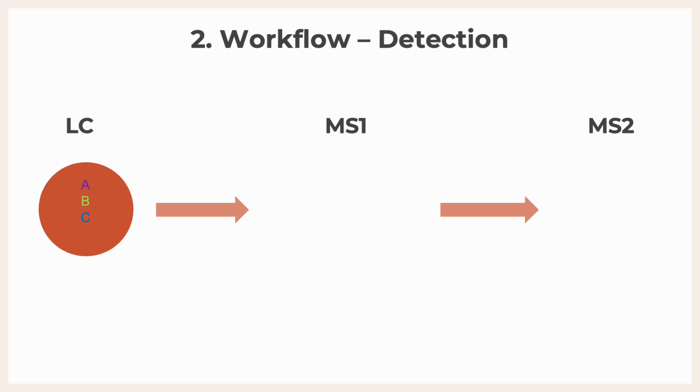So we're going to zoom in onto our analyte. And as you can see, we have A, B, and C, which are all protein chains. So this is one interconnected protein chain, which is then going to break apart within our first mass spec, right? So we have a protein or a large peptide chain as our analyte, and then we're going to break it apart into A, B, and C, which are all protein chains of a shorter length.